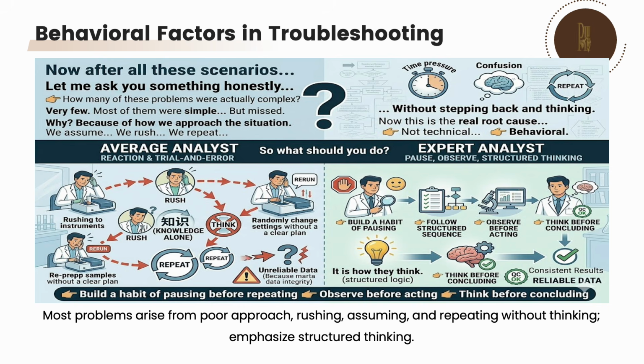Now, after all the scenarios, let me ask you something honestly. How many of these problems were actually complex? Very few. Most of them were simple but missed. Why? Because of how we approach the situation. We assume, we rush, we repeat without stepping back and thinking. Now, this is the real root cause, not technical, it is behavioral.